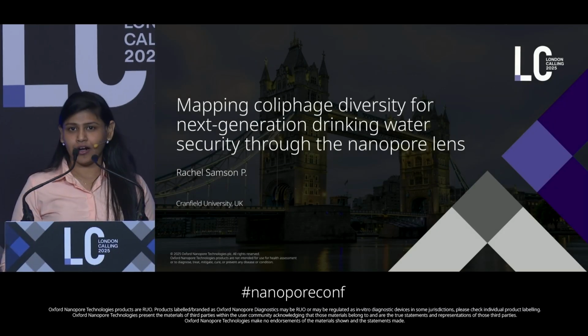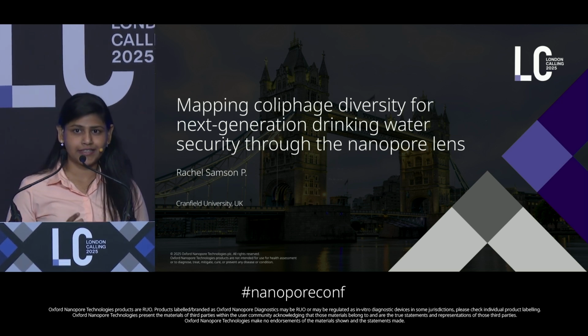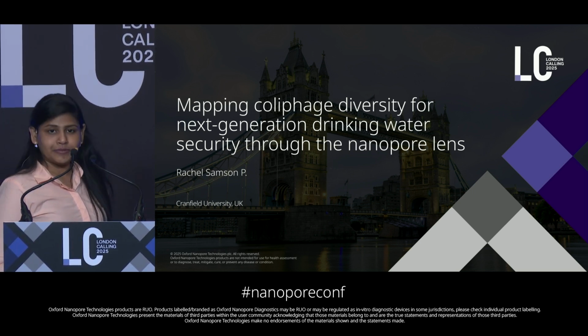Today we'll be seeing how these tiny coliphages can be used as proxies or sentinels to map the viral contamination in drinking water, and how Nanopore helps us to achieve this.